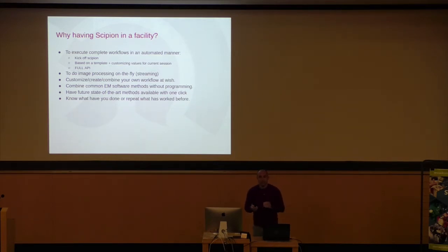It's just your decision. You want to have MotionCor, okay. You want to rely on MotionCor, that's fine. You want to do the picking with Cryolo or with other picking, that's fine. This is up to you. You design it, you customize it, and it's your decision.